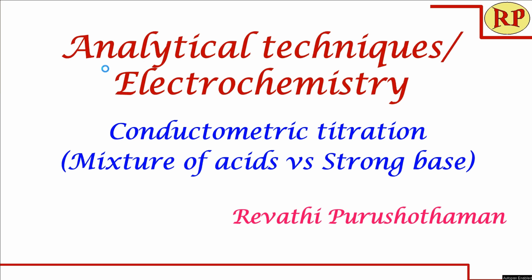Welcome to another session of analytical techniques or electrochemistry. Today we'll look into conductometric titration, that is, mixture of acids versus strong base. We have already seen in our previous session strong acid versus strong base and weak acid versus strong base. Today we'll look into the mixture of acids versus strong base.